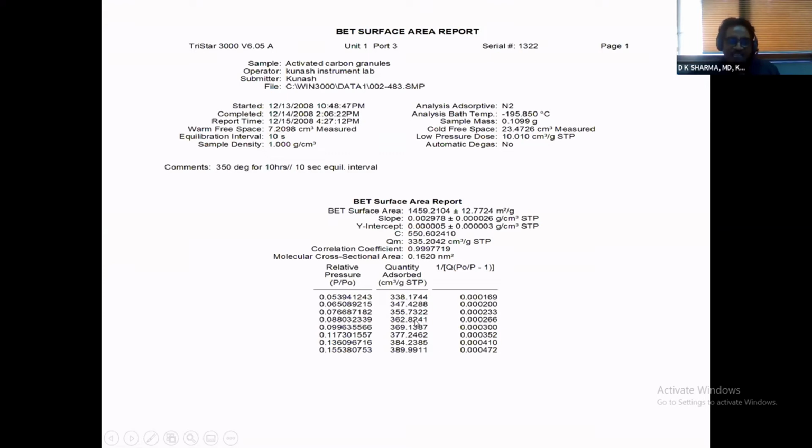This also is an indication that your calculations are not good enough. The BET validity is not good. The Qm value, or monolayer capacity value, has to be in between this range. It should be one of these values or between these values. Then only are the calculations, I would say, of some quality.